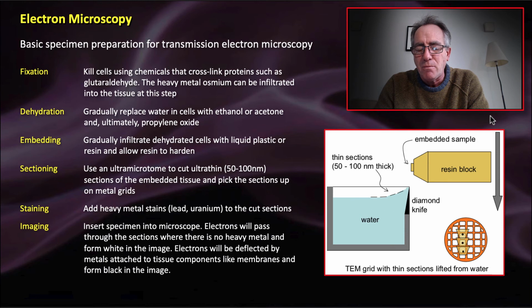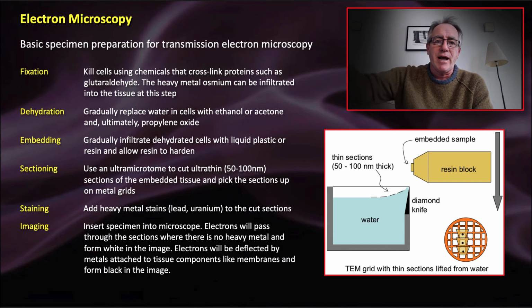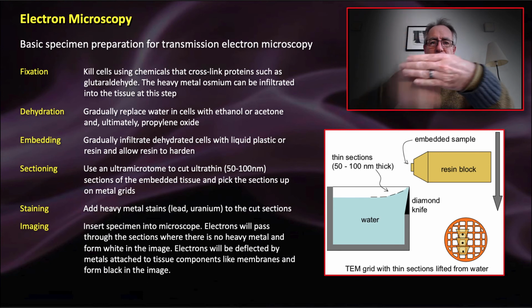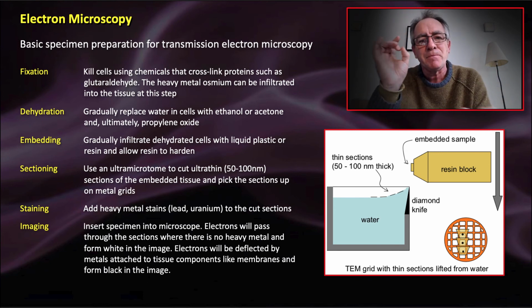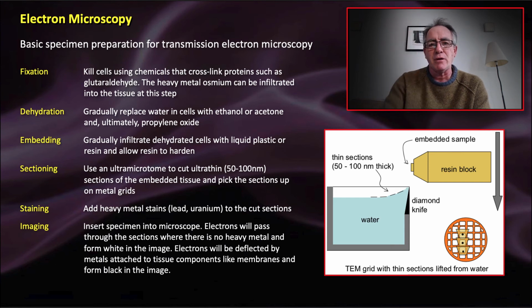The microtome works automatically for electron microscopy. It's not like microtomes that you might have seen for sectioning wax, where you rotate a big handle around and the specimen goes up and down over top of the knife blade and it cuts thick sections. The sections for electron microscopy are called ultra-thin sections. So the machine works automatically. It moves the specimen like this, up and down over top of a blade.